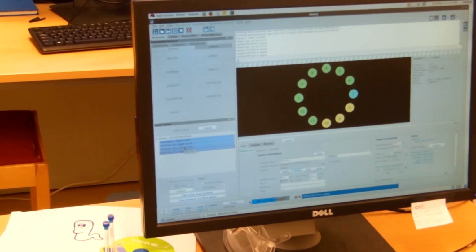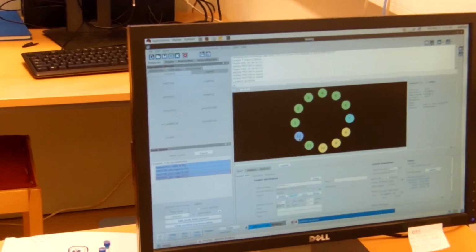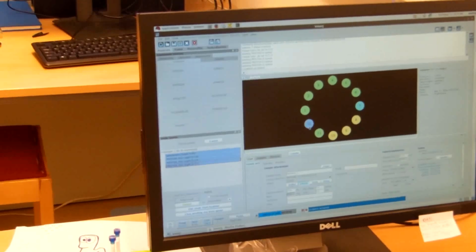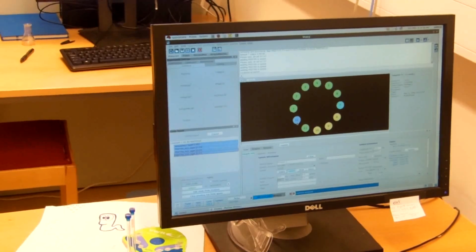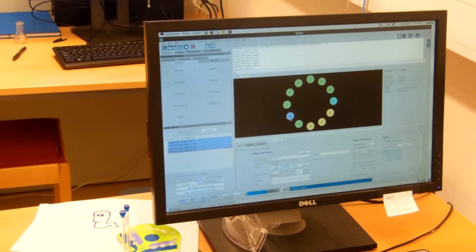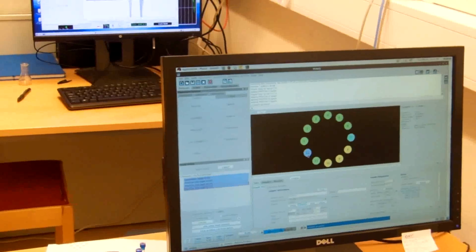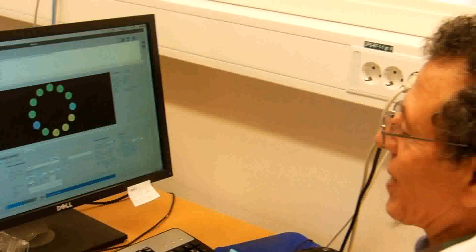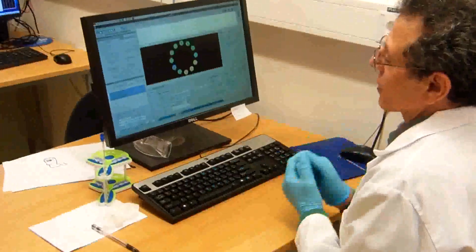When you do submit, the machine will take the sample. Now you can see that it has changed from green color to this violet color, which means that it is in the queue to be processed. After the sample is finished in the NMR, we will process the spectra. Now we will get the spectra of NMR and the spectra of LC-MS. It means that we get all the spectroscopic analysis. Then we can sit with the spectra and do the structure elucidation. Then the story is finished.